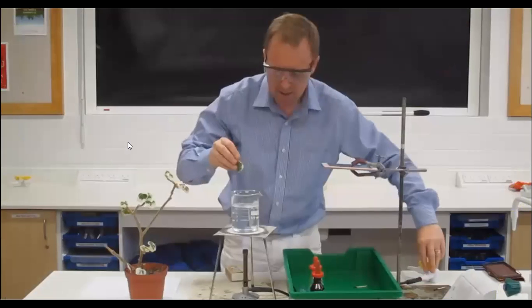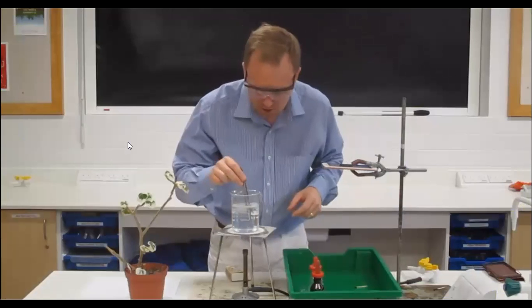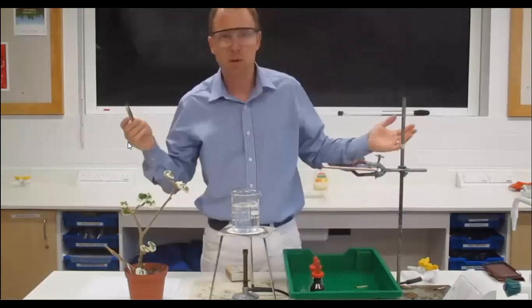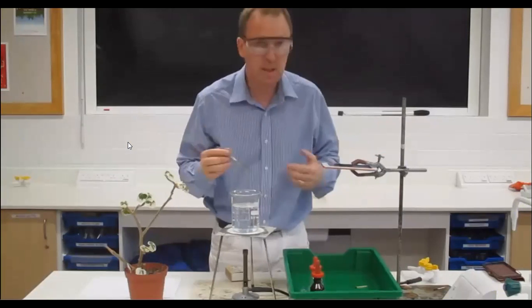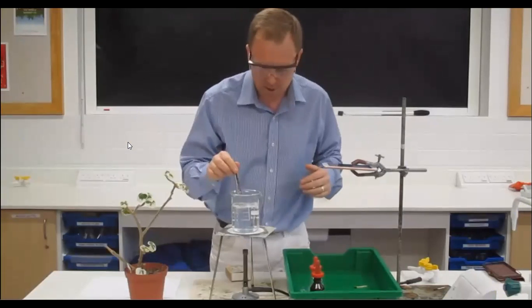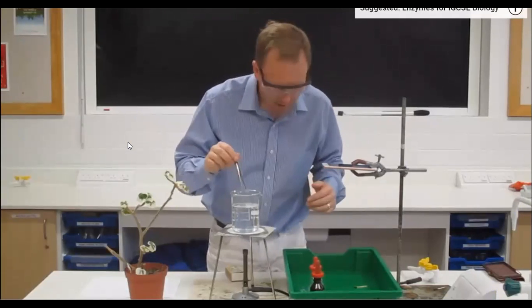Great, our water is boiling now. I'm going to turn that off here. It's hot enough, I don't need to keep it boiling. I'm just going to get the leaf under the water. There we go. And we're just counting for about 20 seconds. That's all that's needed. It's going to soften the leaf, it's going to soften the cellulose fibers in there as well as denaturing the enzymes. So I think that will do.